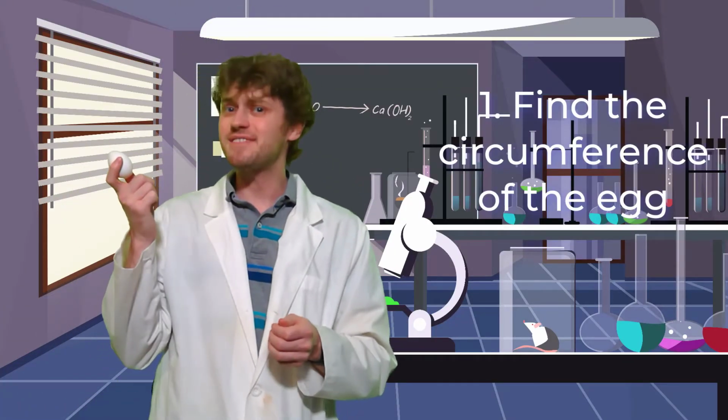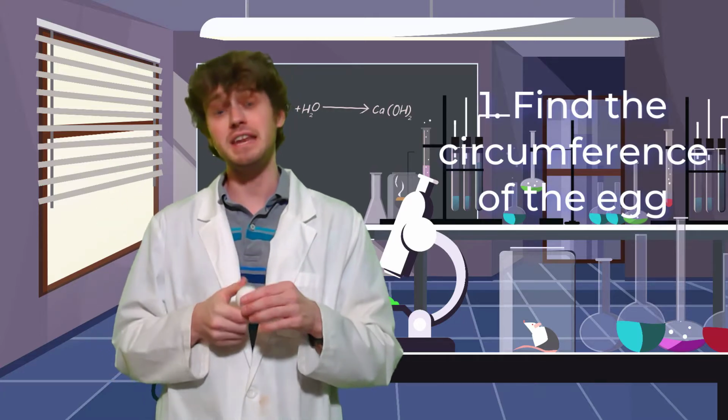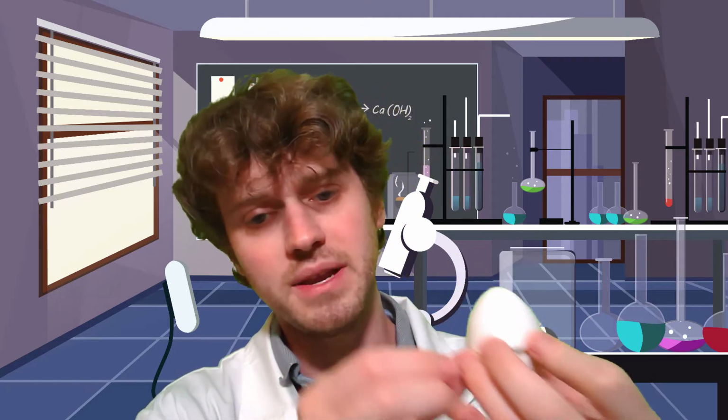Now that we have the mass of the egg, let's find the circumference. To find the circumference, I'm going to need a piece of string or ribbon and a ruler. All right, so I'm going to take my ribbon, that's all I have, and I'm going to wrap it around the fattest part of this egg that I can find. And I'm going to see where, it's kind of hard for y'all to see this, but I'm going to see where the ribbon meets, and I'm going to mark that spot.